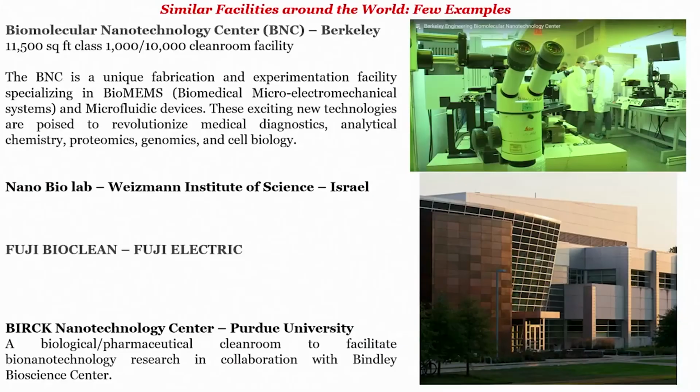If you see the screen, what you see is the Biomolecular Nanotechnology Center, which is at Berkeley. You can see here, right. This is a unique fabrication and experimental facility specializing in biomems, biomedical microelectromechanical system and microfluidic devices. These exciting technologies are poised to revolutionize medical diagnostics, analytical chemistry, proteomics, genomics and cell biology. You can see biology experiments that should be done in a clean room, class 10,000, right.